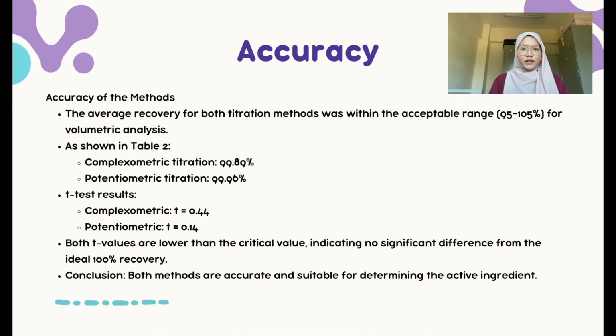As shown in the results, complexometric titration achieved a recovery of 99.89%. Potentiometric titration showed a recovery of 99.96%. To statistically confirm these results, a t-test was performed.